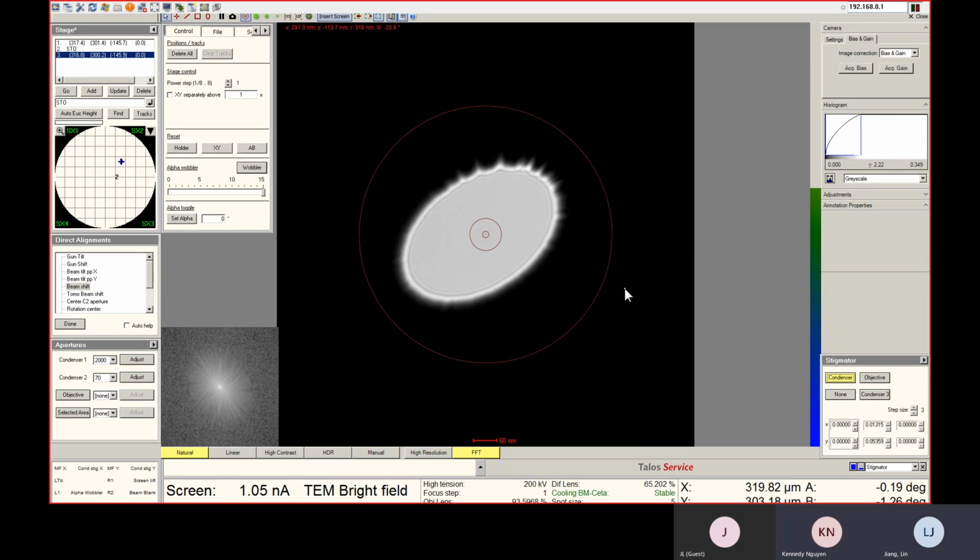You can use the up arrow and the lower arrow there, and you can also adjust the step size. You can just click the arrow here, and then you can increase the X value or decrease the Y value. Push the arrow there, just the up arrow, and this is bigger.